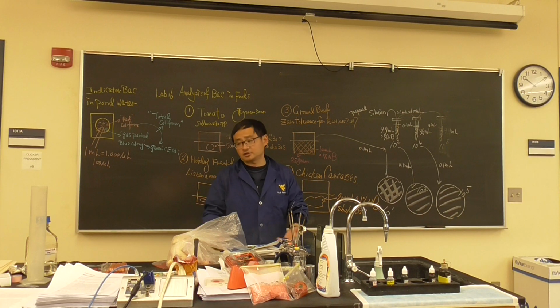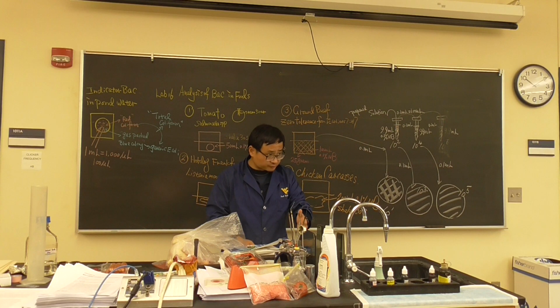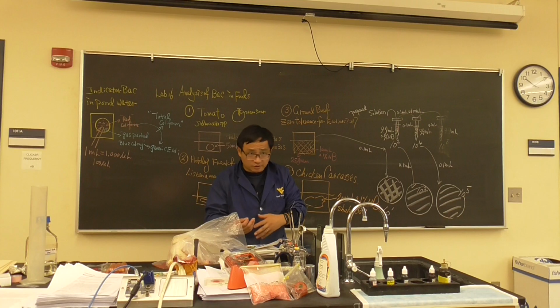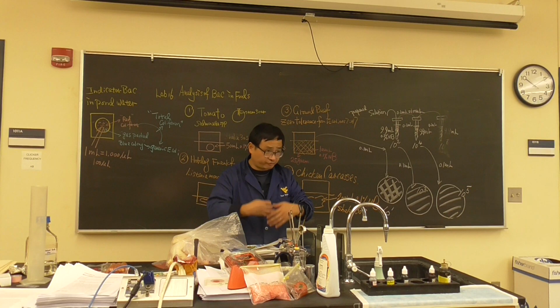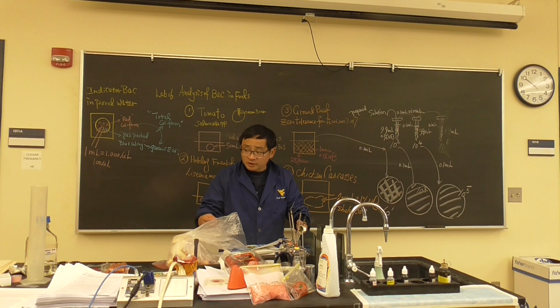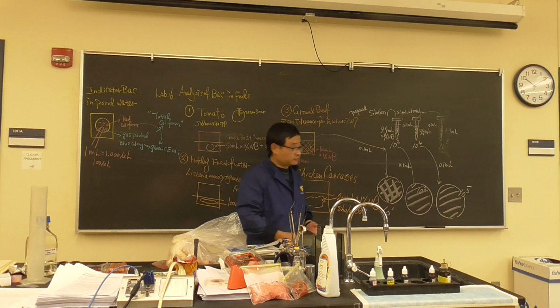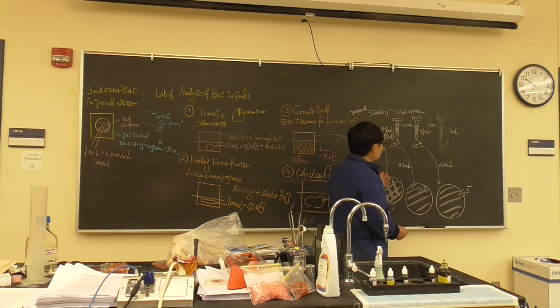In case there are really lots of bacteria, let's say ground beef, because for ground beef they cut the beef, then they grind it. There is more or less a mild heat generally. That heat is usually 40 degrees Celsius. It's favorable for bacterial growth. There is higher nutrition there, and blood, and moisture. So ground beef usually is very high. Okay? So that's what we're going to do.